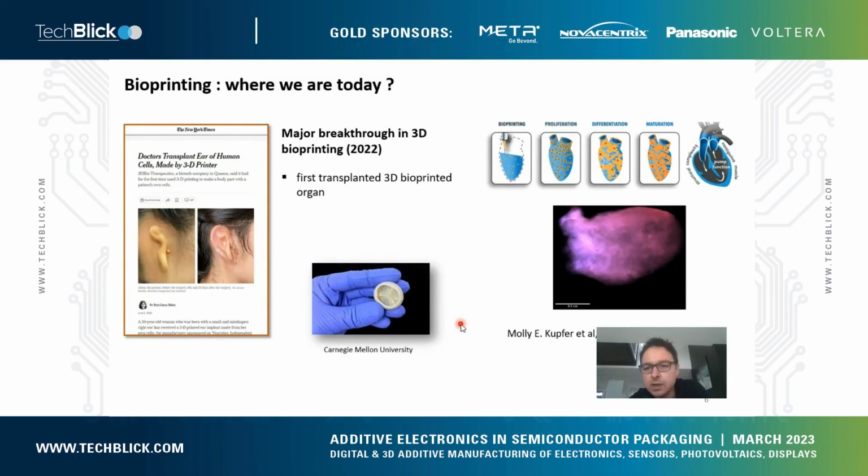We also have here a model of a micro heart. It's about a couple of centimeters, where cells have been printed and differentiated, and over time they have demonstrated the functionality by beating at proper frequency, as we see here. Another milestone in 2022, where researchers have printed an ear and transplanted it using cells from the patient.